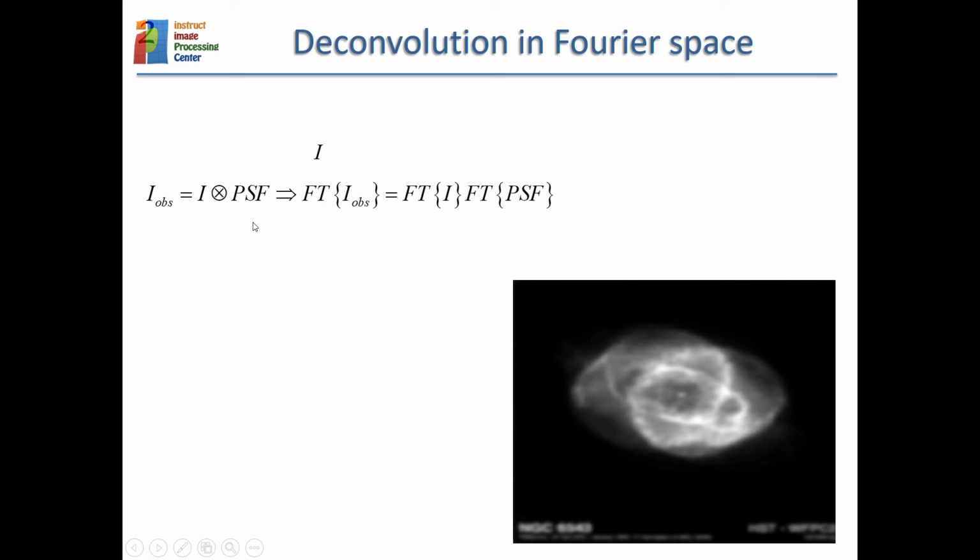And very simplified, because this PSF may not be the same all over the place, so you have to make careful corrections locally, and also because we are forgetting about the noise and even more subtle details, because the exact model of the microscope may not be a convolution, but some other non-linear operation. But let's keep it simple.